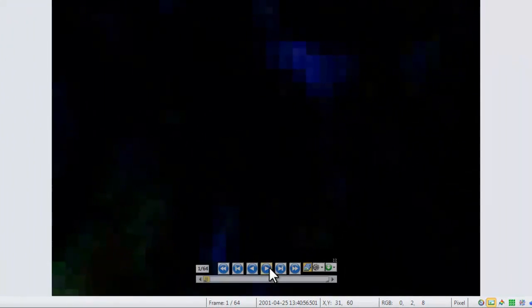If I simply want to view it in image mode, I can do that as well, and you'll see that your set or your sequence file will show the number of frames at the top right next to the name of the image. A play bar will be along the bottom, and we'll be able to simply play through our image.